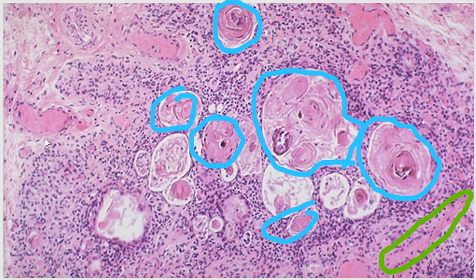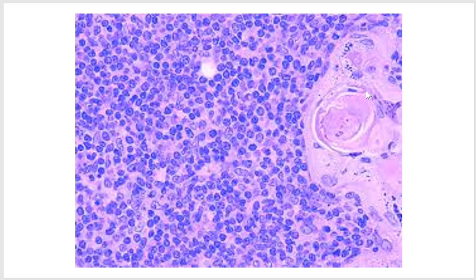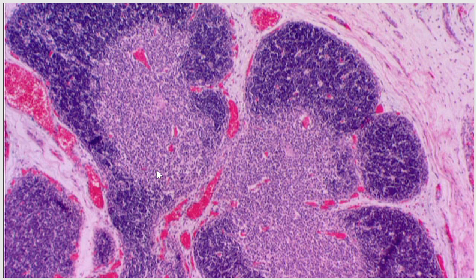Okay, so here's another image of the thymic corpuscle here. And here's another one for the trabeculae. Okay. And here is your capsule right there.